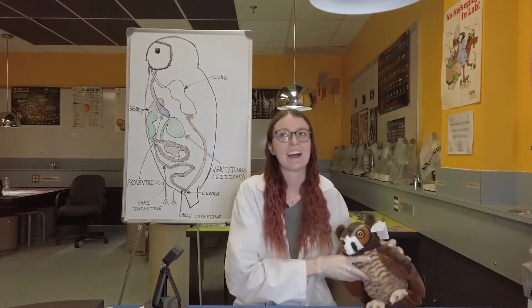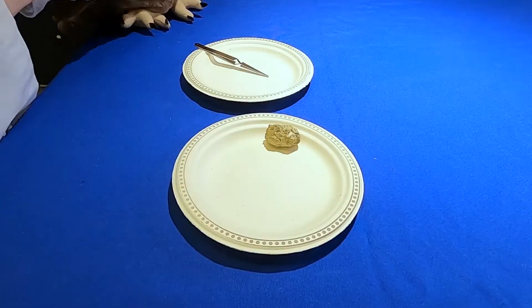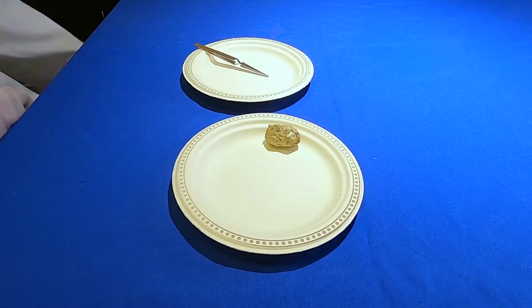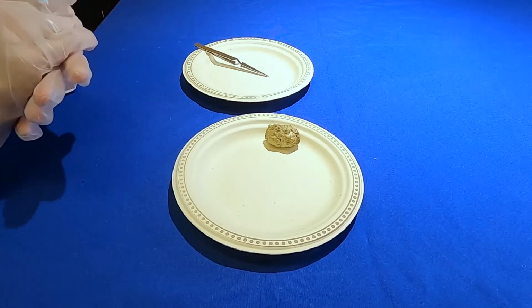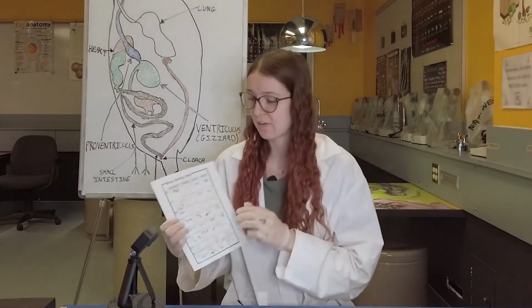Now today, I am going to be showing you how to dissect an owl pellet. Here at the Science Centre, we have a great horned owl named Bubo, so that is where we get our pellets from. To do this dissection, I need a few tools to get started. I made sure to have my lab coat on, gloves, and my glasses on for safety. I also have a couple paper plates to pull my pellet apart on, some tweezers to pick small bones out, and a bone chart to figure out what kinds of bones I have.